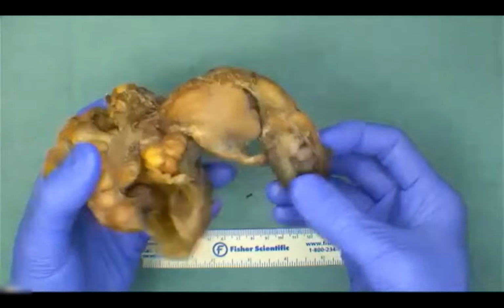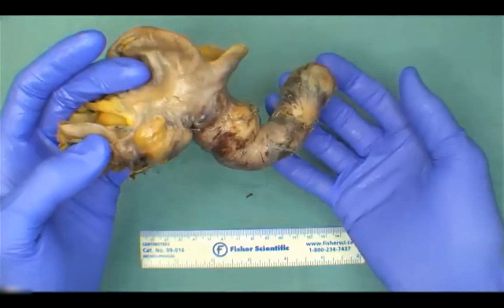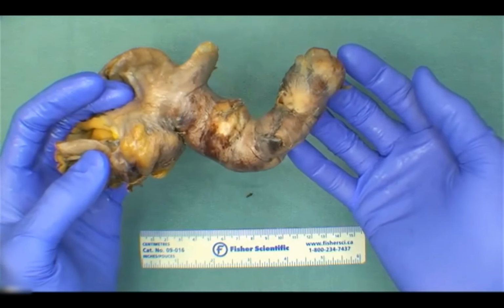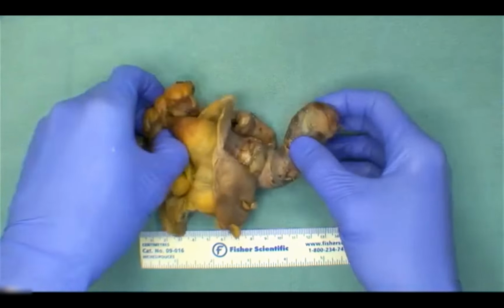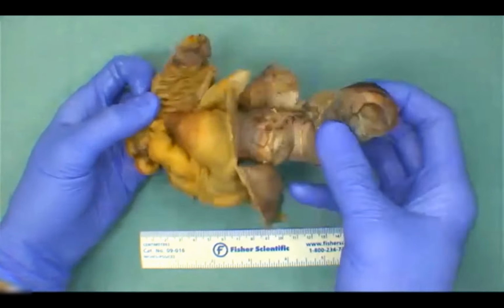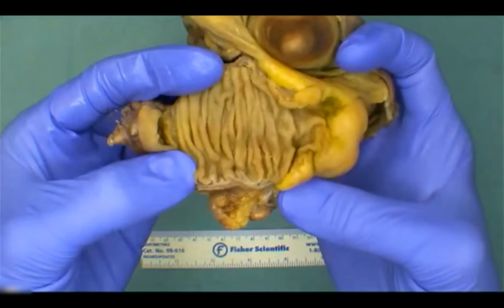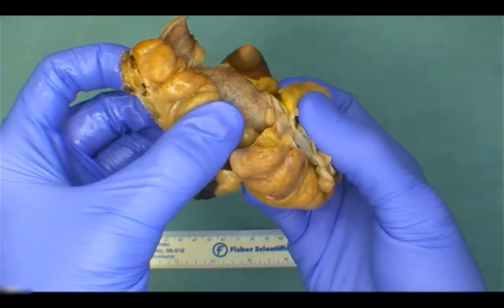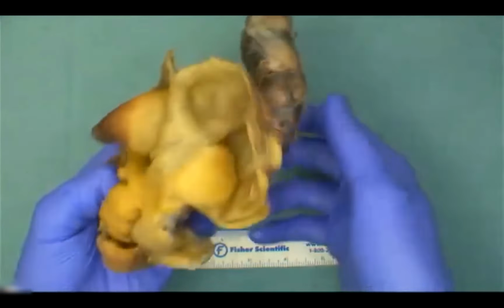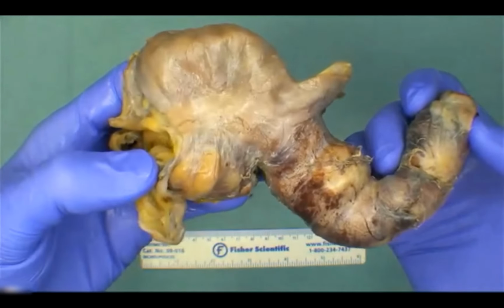And we can see that there's this tubular structure here that takes up the majority of the specimen. I could see why this could be in keeping with maybe a fallopian tube or even a penis. And then as an ovary, we've got enough structures here that might not land us on being an ovary, especially as we start looking at the mucosa. Okay, so what we've got here is a nice segment of terminal ileum. Okay, that's that small bowel component that we were looking at earlier. As we transition into the large bowel, we have our ileocecal valve. We have the appendix and a nice example of the base of the cecum.